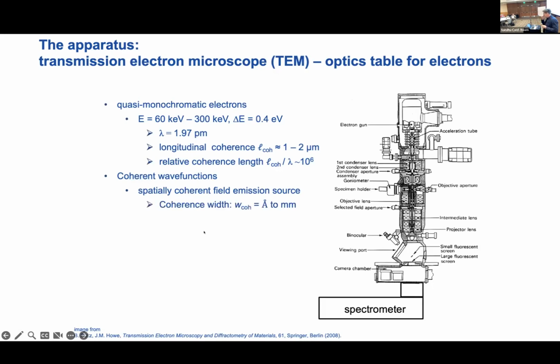Well, it's emitted from about a point source, and you can collimate that, and you can spread the beam with a lens. And using apertures, you can get a very cold beam in the transverse direction, meaning the electron has phase coherence across the width. You can vary the width from an angstrom. You can focus these beams down to really sub-angstrom widths. Or you can spread it out over millimeters or centimeters.